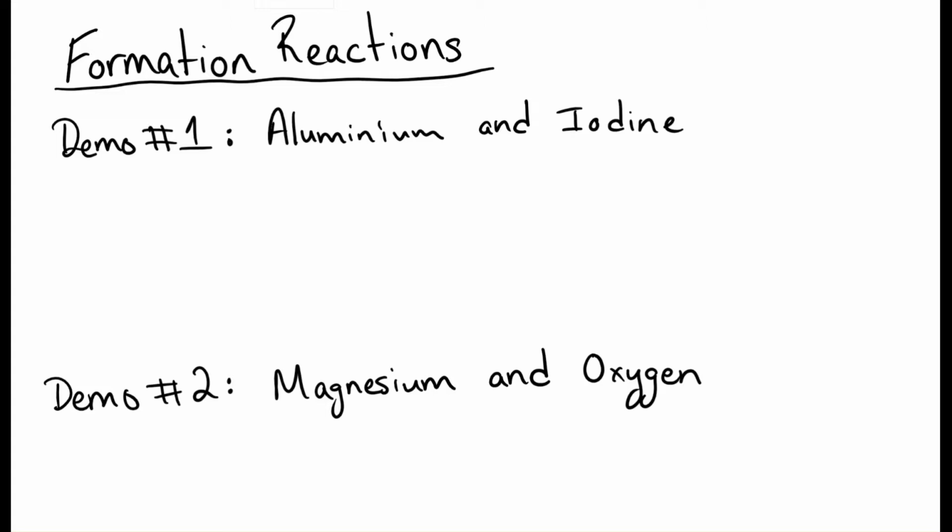We're going to figure out, is it endothermic, is it exothermic? And then we're going to try and write the chemical reaction for it. So let's go ahead and watch the first reaction. It's a couple minutes long, but let's watch it, and then we'll come back and write down the chemical reaction for it.